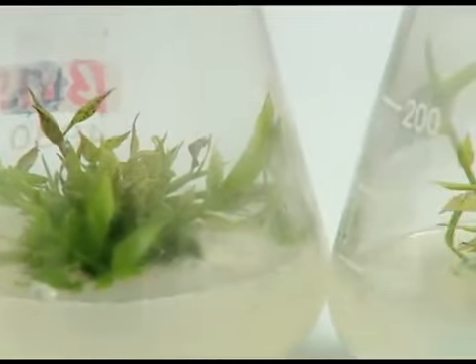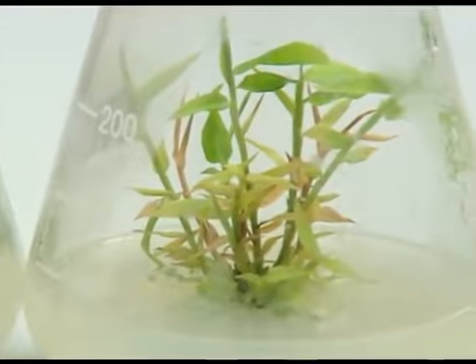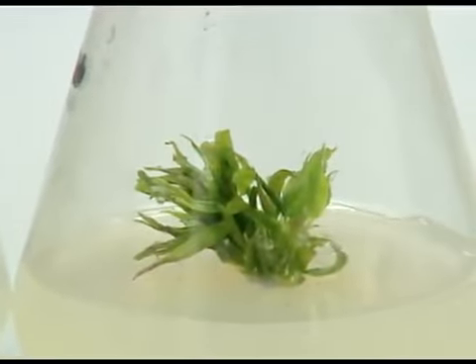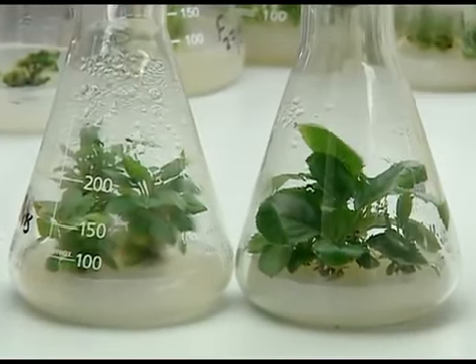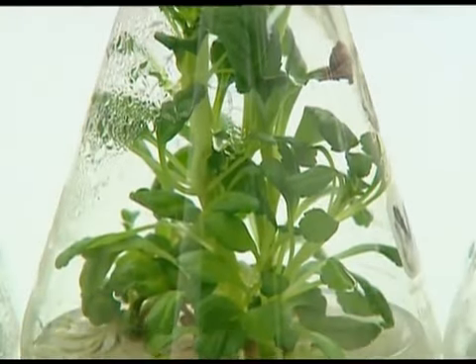After a period of time, one ends up with a large number of shoots in a single flask. Once the shoots have grown to an appreciable height of about 3 to 4 centimeters, they are rooted.